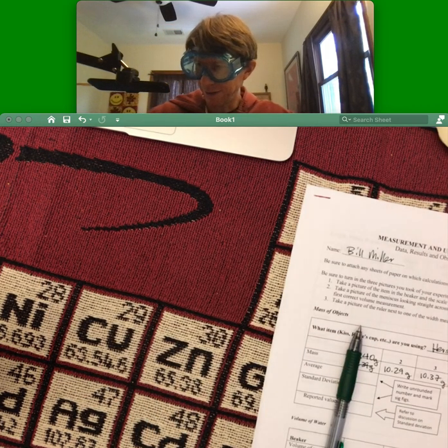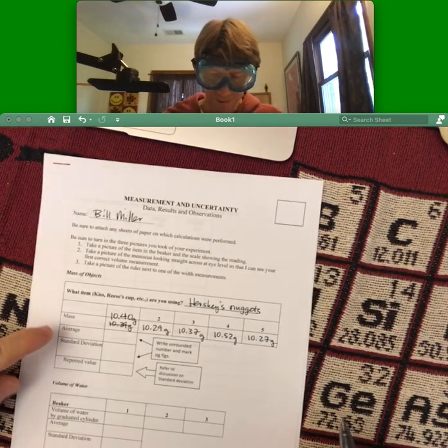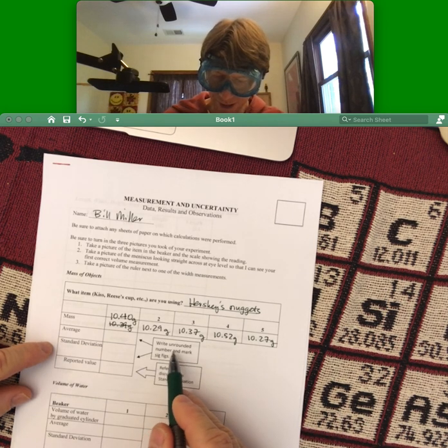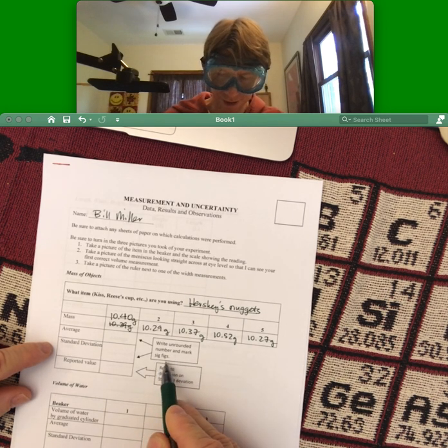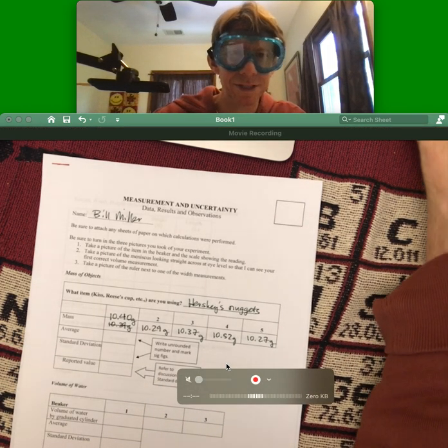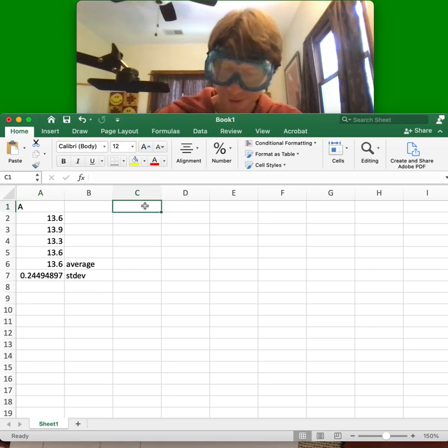And now, let's do the average and standard deviation. And it says, write unrounded number and mark sig figs on it, so we'll do that. I'm going to go back to my Excel spreadsheet. And this time, I'm going to do it for nuggets.